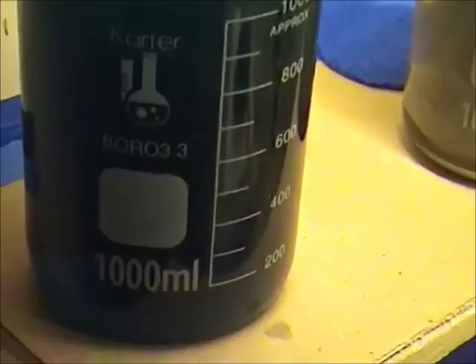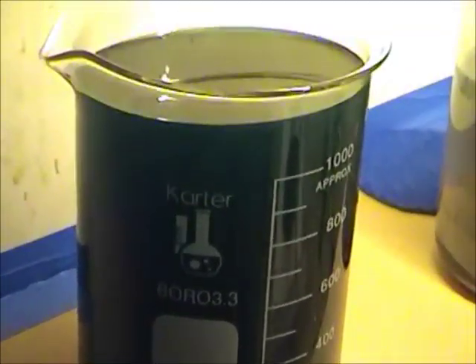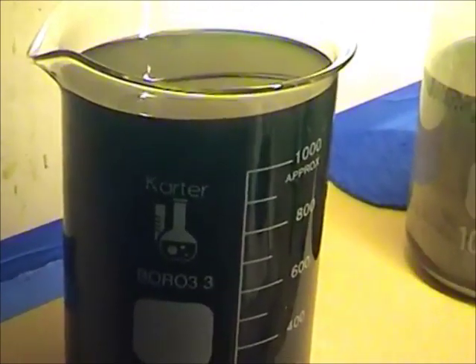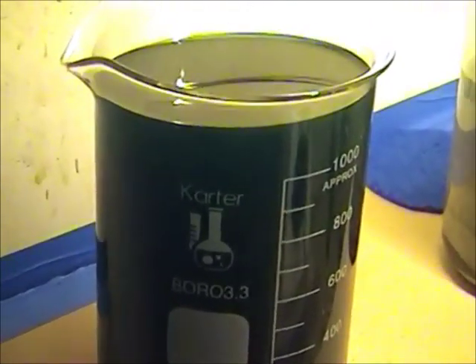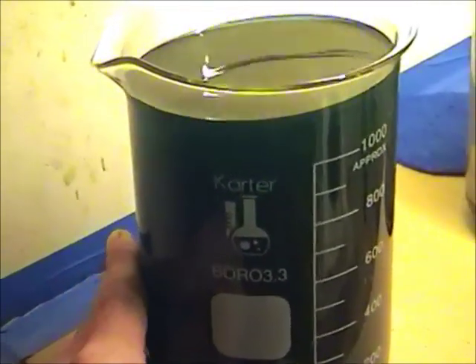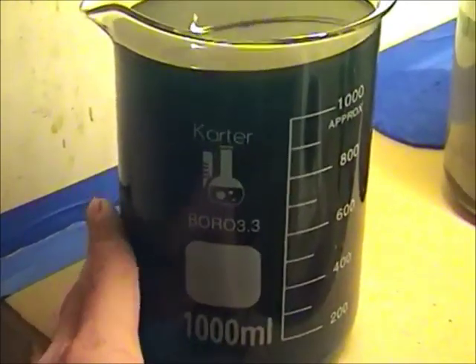What I have here is some of our solution that we've already filtered. It's a nice blue color and it has no particulate left in it. I've tested it with salt water and it tests negative for silver. So we have a total reduction.